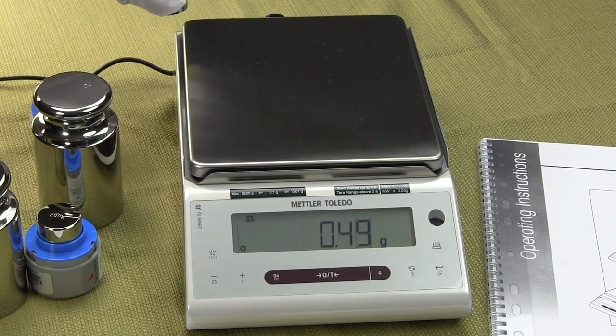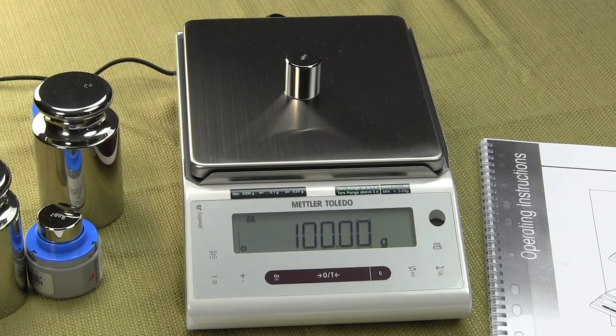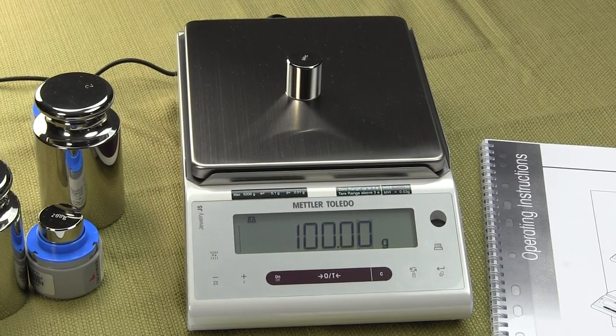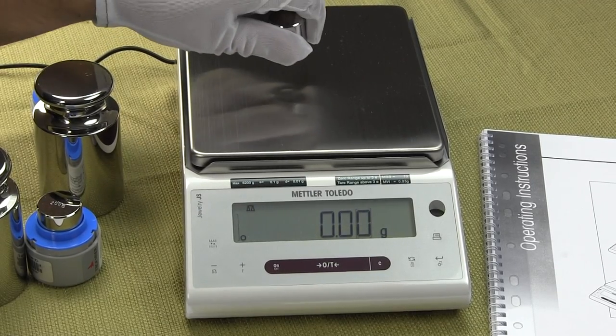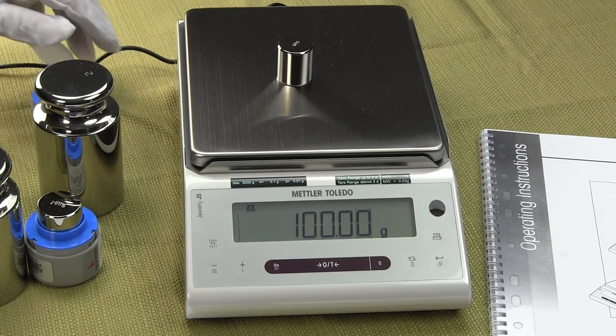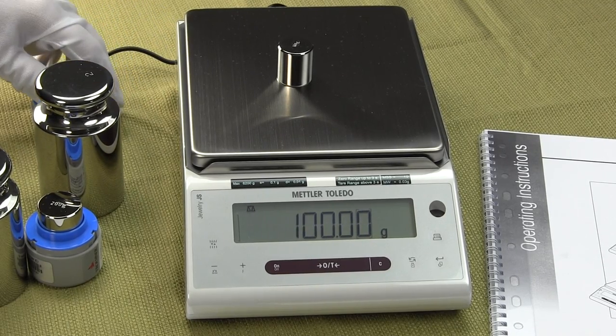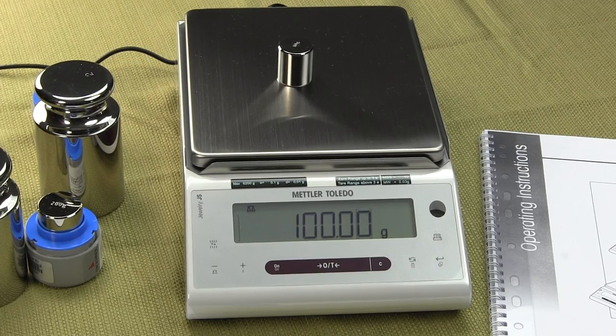The balance is made in Switzerland. One nice thing about Mettler Toledo with these JSs, they have not sent the balance overseas. They're made in Switzerland to maintain the quality.